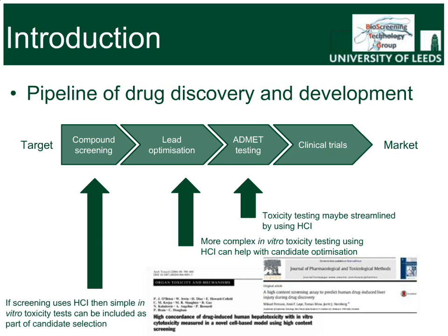These platforms can be utilized at all stages of the drug discovery and development pipeline in terms of identifying toxic compounds as part of lead optimization, and for those tests required by law. There have been a number of publications exploring the utility of high-content screening to identify hepatotoxins and their mechanisms of action in multiplex assays. Of particular note are those by O'Brien and Pearson, respectively.